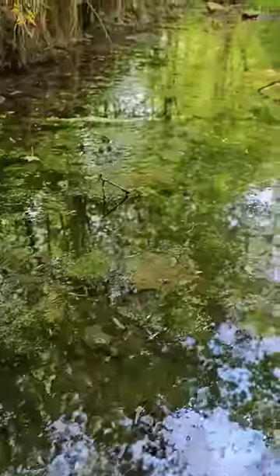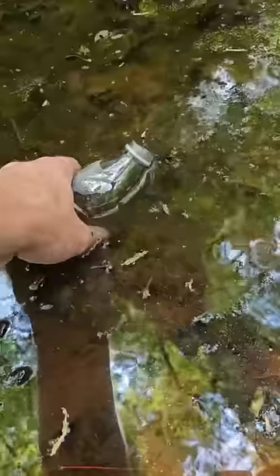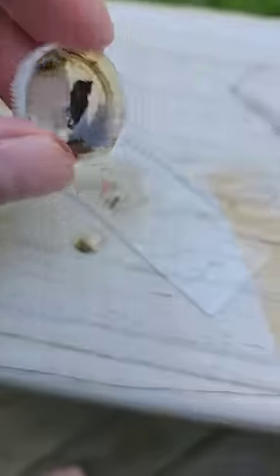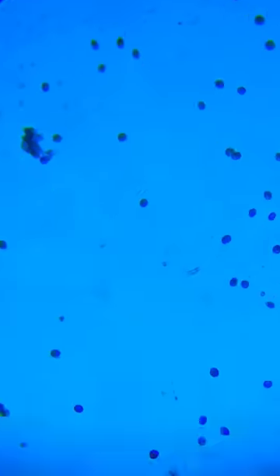I'm going to test the results of one of these under a microscope. I'm going to take a sample of really nasty pond water here and see what it looks like on a microscopic level. Then we'll look at the results after it's filtered.